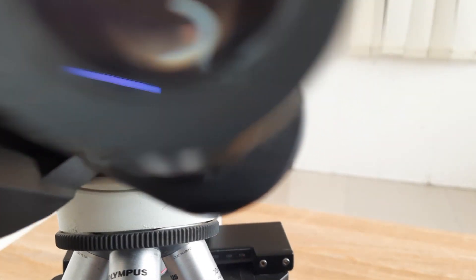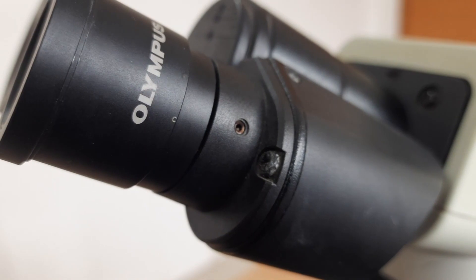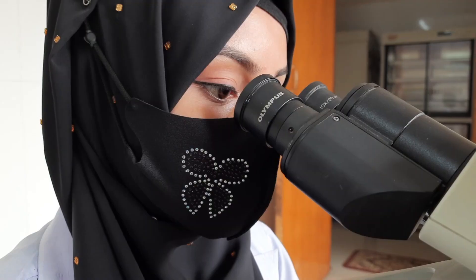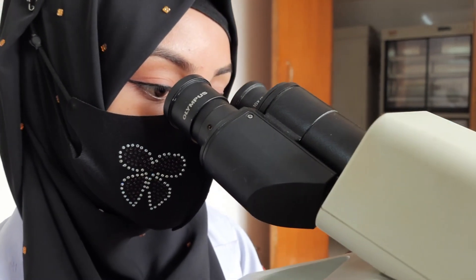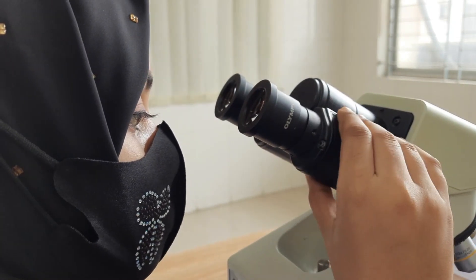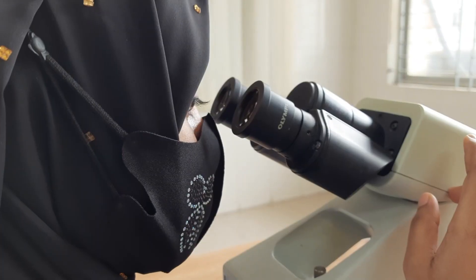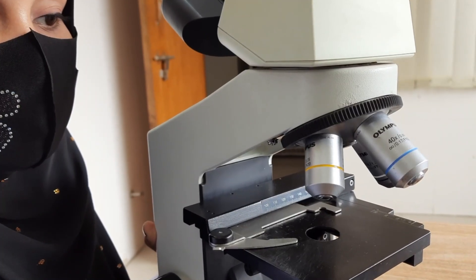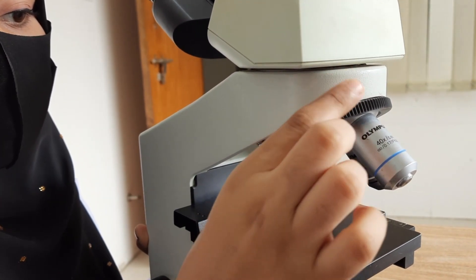The eyepiece is the lens you look through when using the microscope. It typically provides 10x magnification and is where you observe the specimen. This can be adjusted according to our eyes by rotating. The nose piece is a rotating component that holds the objective lenses.